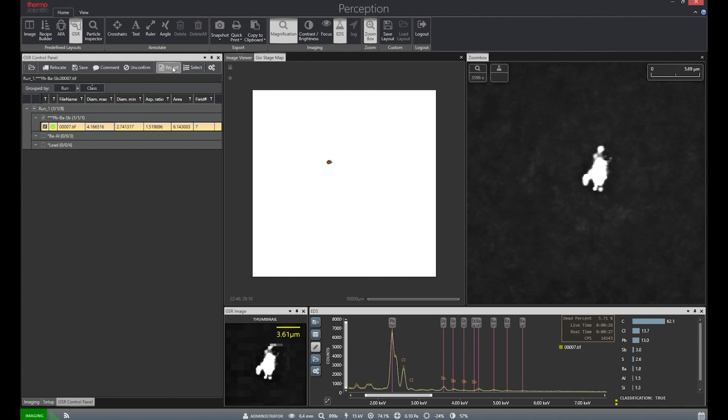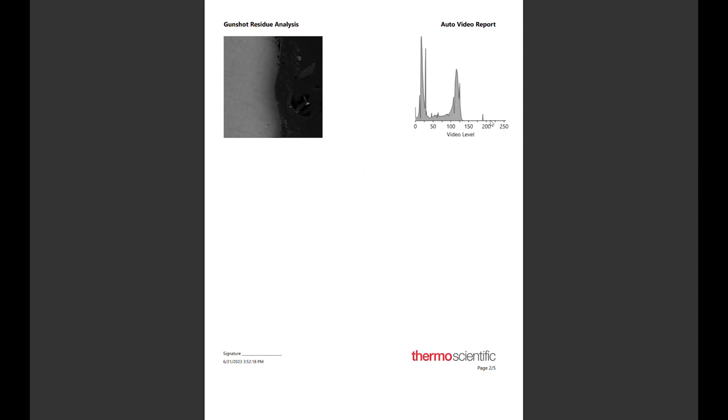We can then generate a PDF report by simply clicking the report button. The generated GSR report is broken down into multiple sections, with the first being the auto video report. This shows the spot where auto brightness and contrast was conducted.